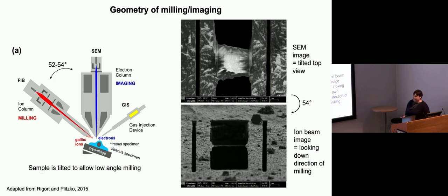For those of you who know me, you won't be surprised that this is bacteria. What I have instead of this cell growing on the grid is that I have a continuous layer, a few microns thick, sitting on there. This is the SEM image. So it's a top view, but it's not a perfect top view. It's a tilted top view. This is my milled lamella. You can see the bacteria in it. This is the front of that lamella. This is the back. And if you look closely, you can just about see the quantifoil remaining at the back here.